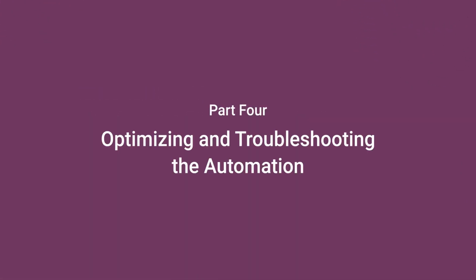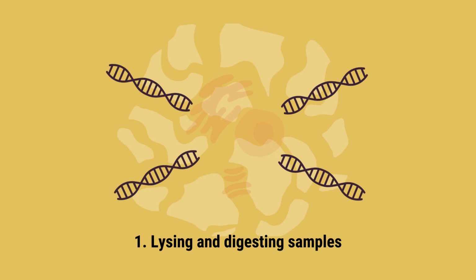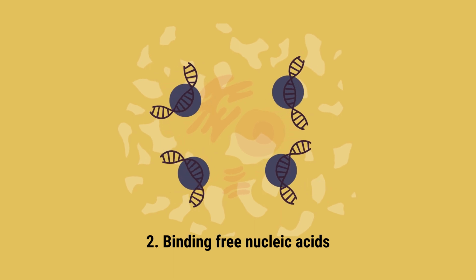Time to combine what you've learned about nucleic acid extraction chemistry and liquid handling robotics. There are 6 core steps to most automated nucleic acid extraction workflows using magnetic particles. 1. Lysing and digesting your samples. 2. Binding free nucleic acids to the magnetic particles.